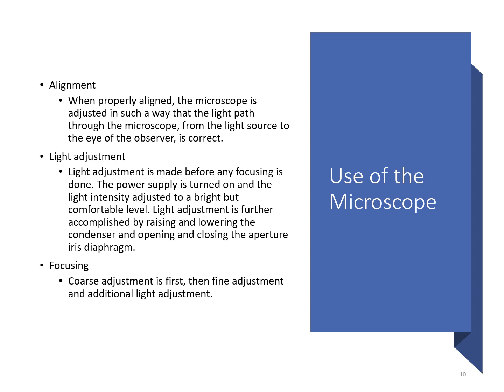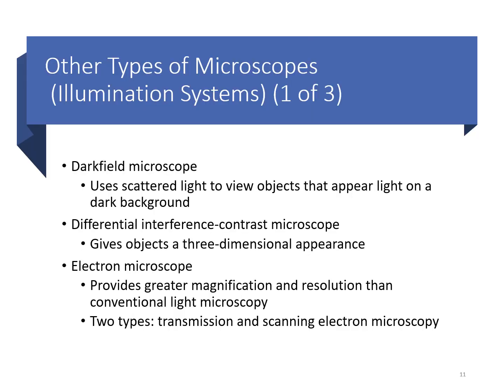So we're going to learn how to first do a coarse adjustment, and then once we get our specimen in our field of view, then we're going to do a fine adjustment, and we'll also do some adjustments to our light source.